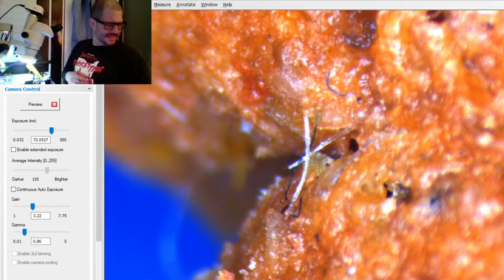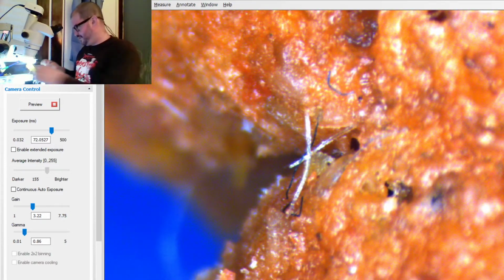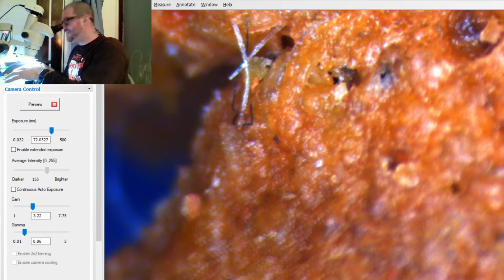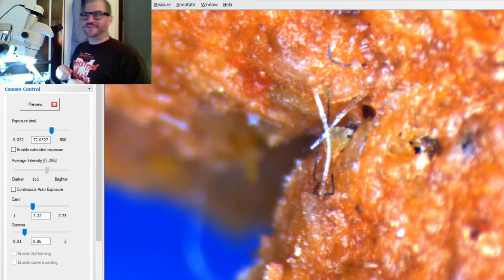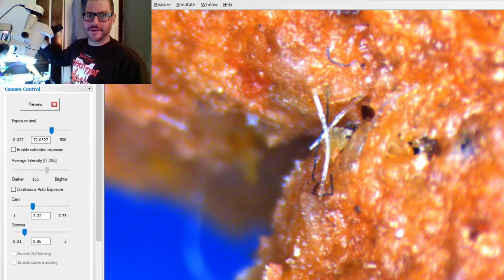What is that? Do you want to know what you've been eating? I don't even know if I want to know. Maybe we should switch, whatever dog poop this is. Look at that. What is that? Let's take a closer look, shall we? Let's go to 40x magnification.